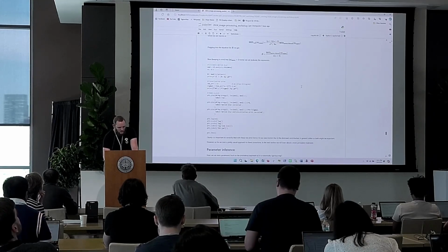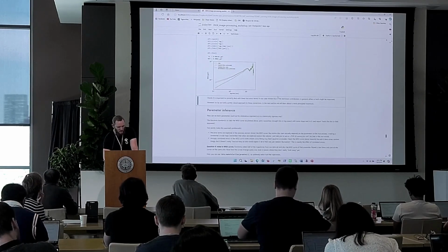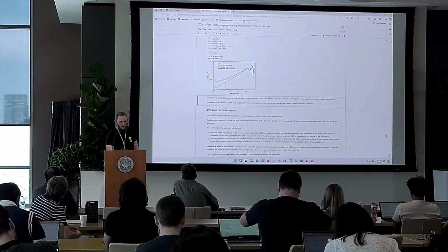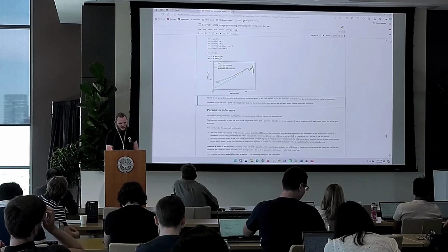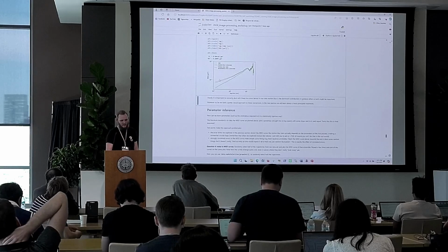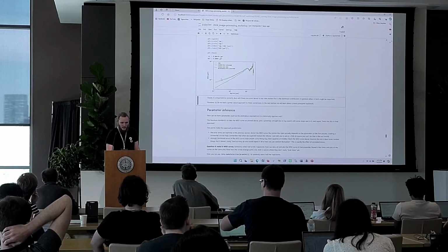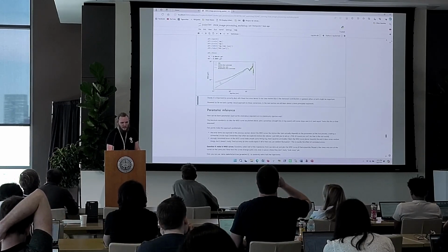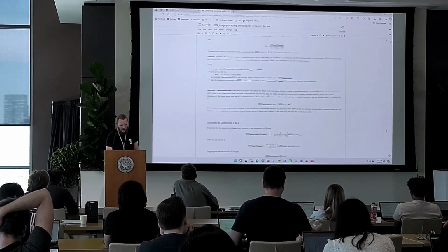So let's see how this works. Here is the ensemble MSD. So the thing that was in black on the plot above is now blue. That's the raw data, the MSD of the raw data. And then in orange, we see the same curve now with this constant for motion blur added back in. And you see that it actually significantly changes things. We then subtract localization error, where here we just use the value that Thunderstorm gives us. We plotted the histogram above.